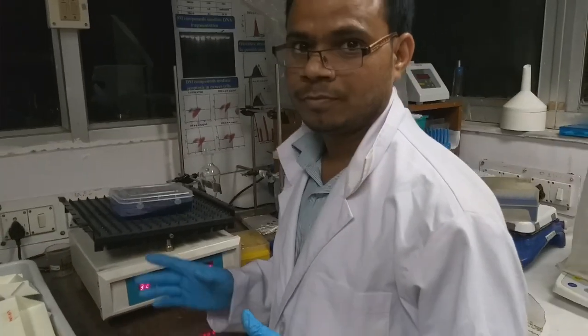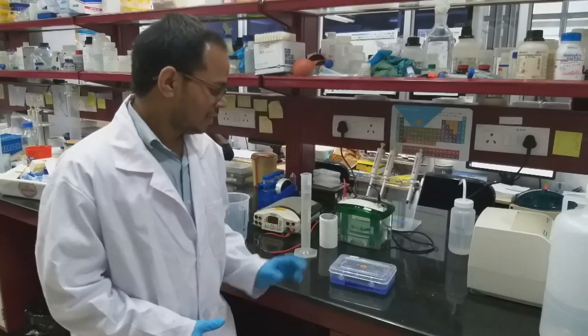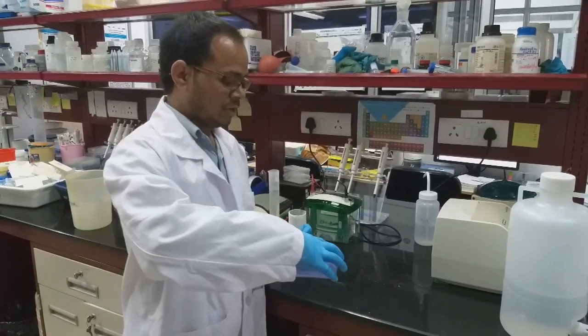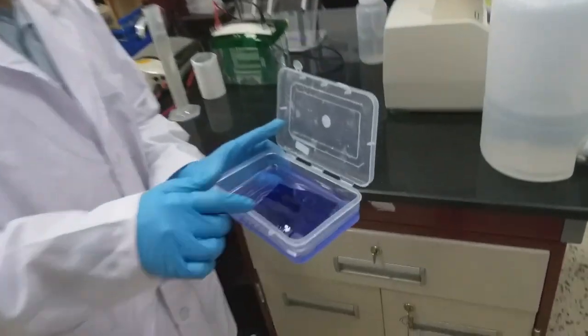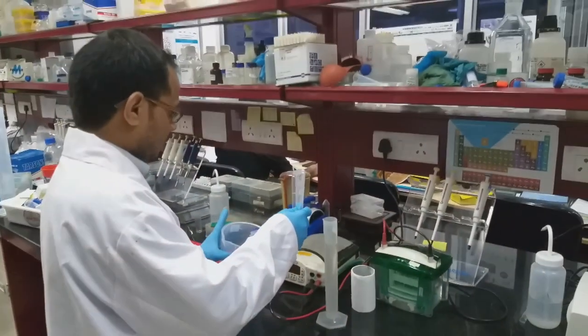So once the time is over, after 2 hours, we will de-stain. Now we kept it 2 hours in staining solution. As we can see, the staining is over. Like we can see, the gel completely turned blue. So we remove the solution.